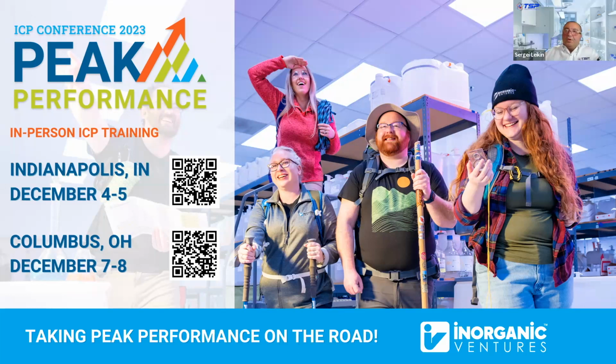Yeah, that's a very good point. I didn't put it in my presentation because it's more of a method development thing rather than what we are focused on today. But yes, Autumn is absolutely correct. The peaks can shift with time. One other reason for poor precision could be that your peak has shifted and you're not measuring on peak anymore. In this case, the tuning solutions recommended by the manufacturers should be run, depending on the instrument, maybe every couple of weeks or three weeks or whatever.